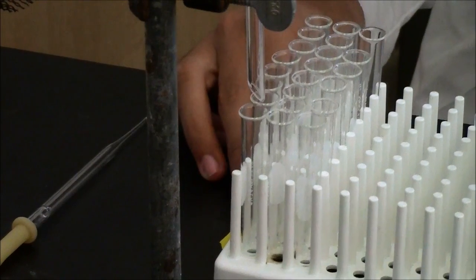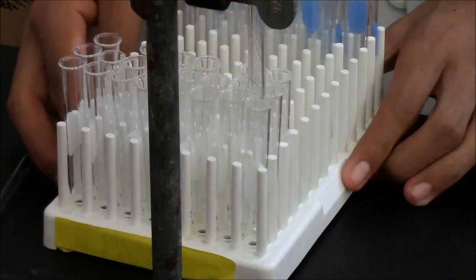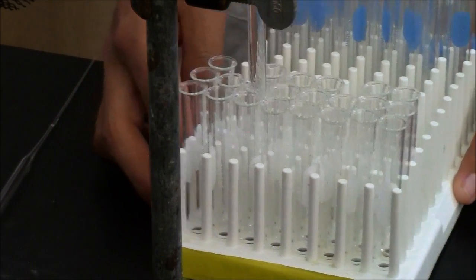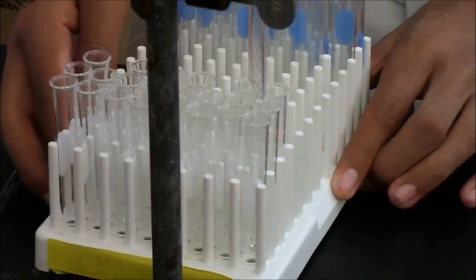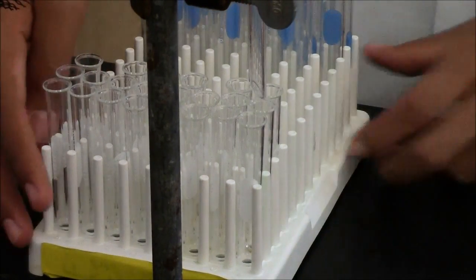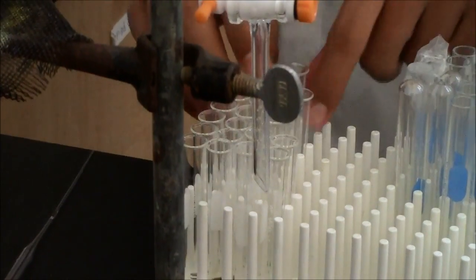Okay, that's good. So here we have about 20 of the baby tubes. These are 75 millimeters tall. And that's the best size for collecting fractions is what we're going to do. And Morgan's demonstrating how you could have the drips go into one tube and then shift it to the next tube. Before we load, we're going to drain the solvent so there isn't any solvent on top of the silica. But you have to have your fraction tubes ready before we load.